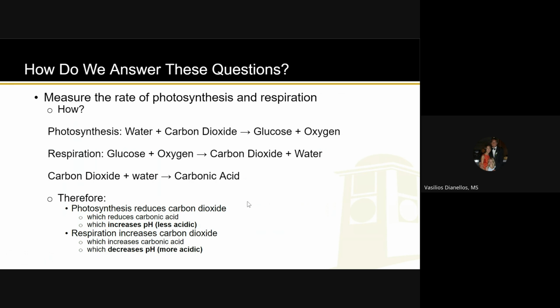First of all, there is a limit to how much the pH can increase, right? It can only get up to 14. As a matter of fact, the thing you're going to use to measure pH doesn't even get that high. So it is quite possible that with photosynthesis, your pH will increase and then stop increasing. And maybe the reason it stopped increasing is because you've just reached the max limit that you can record, right?